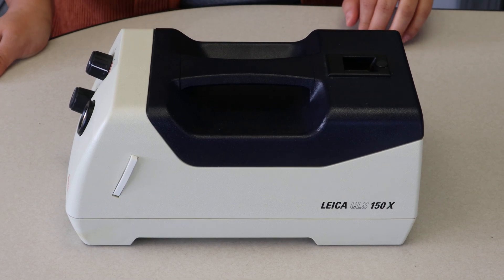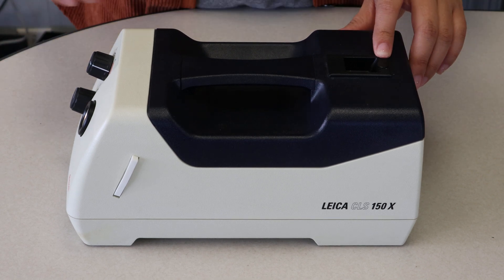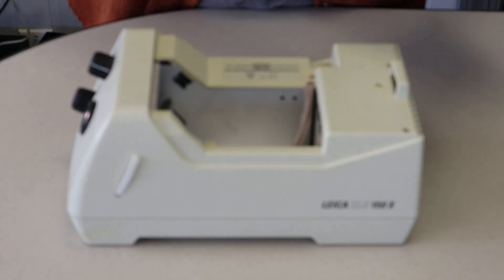First off, you'll notice up at the top there's that little black dot on the sliding lock. Maria's going to go ahead and point it out for me. You're going to go ahead and pull that up while pushing back on the latch, and then lift the cover up, and it will come off.